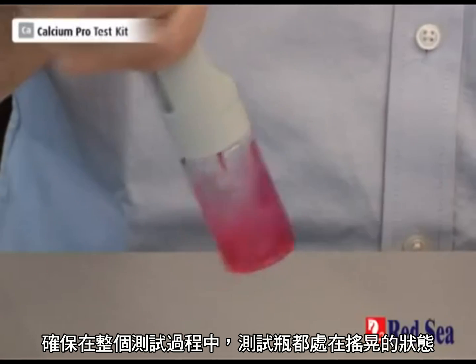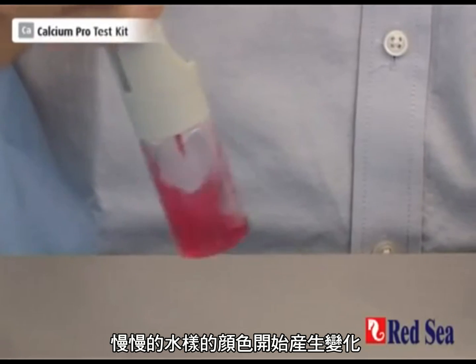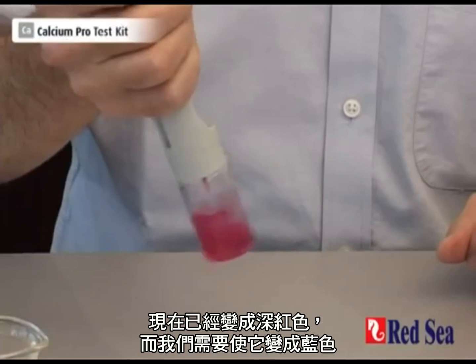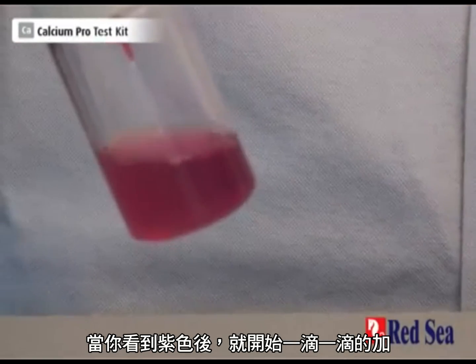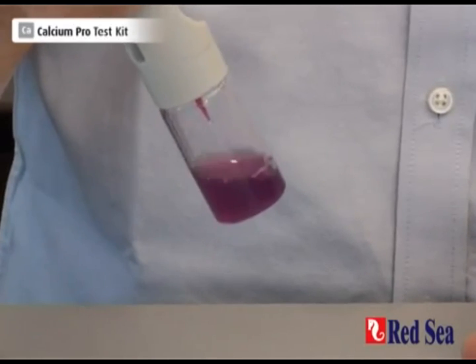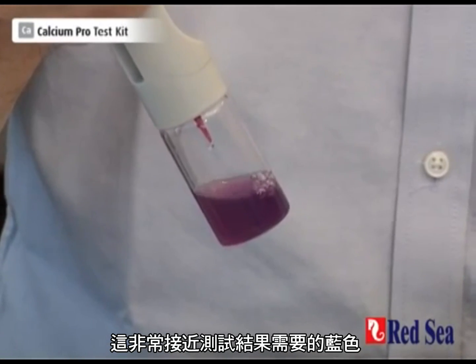Now we're shaking — the important thing is to carry on shaking at all times. Very slowly the sample starts changing its color. It's getting a darker shade of red, and we're looking for a blue color. Once you start seeing a more purpley color, it's time to start going drop by drop. That's a real purple — now just one drop at a time. That's very close to the end point.